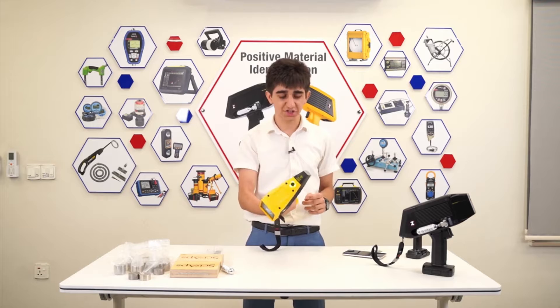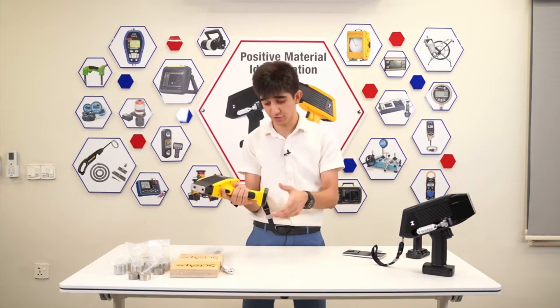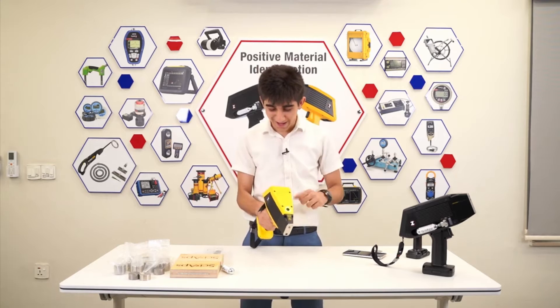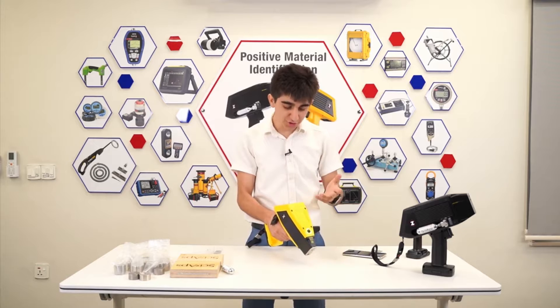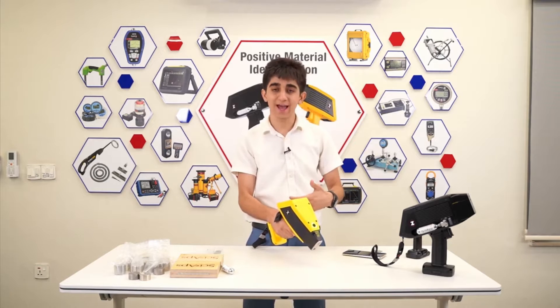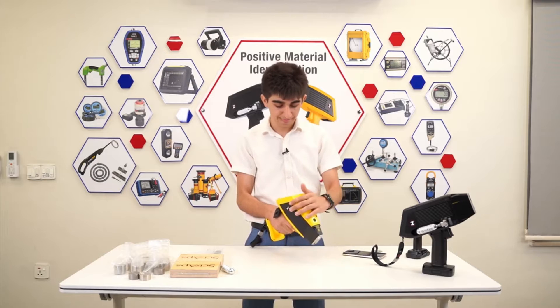Running the test on each of these units is pretty easy. You just turn on the unit — don't forget to put your battery on — and then you press on Analyze. You're prompted to choose one of the applications. In this case, I'm going to choose Alloy.